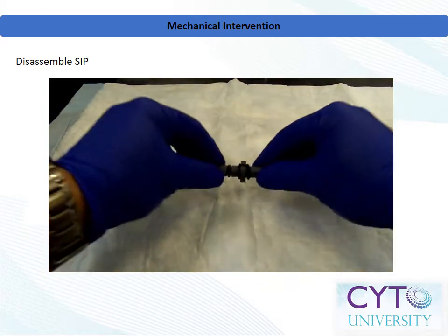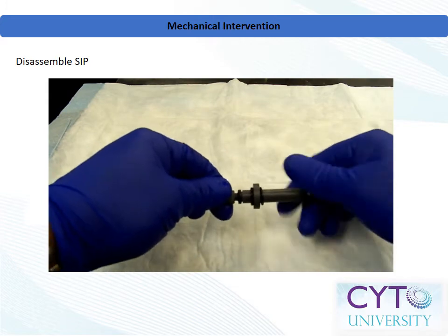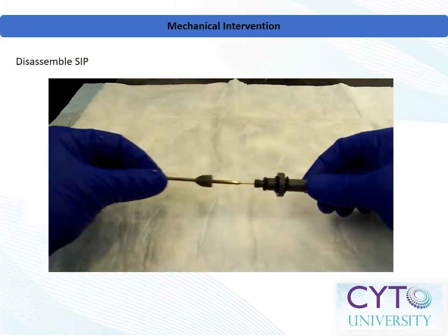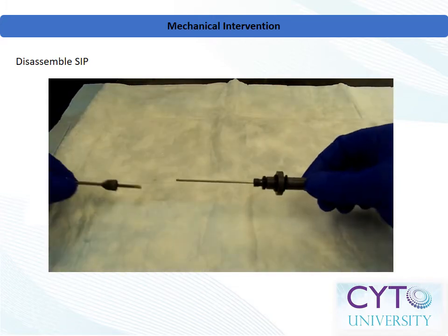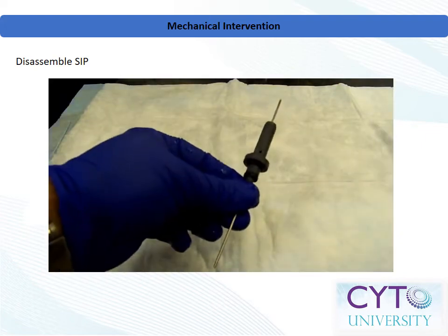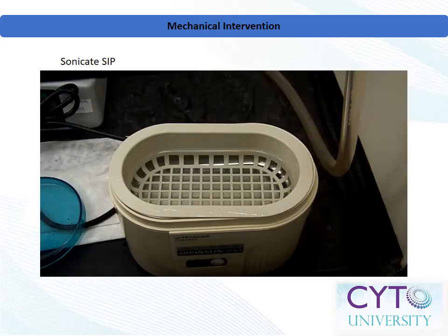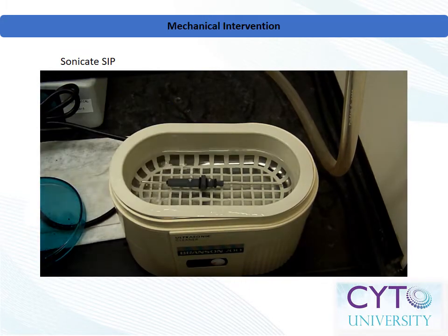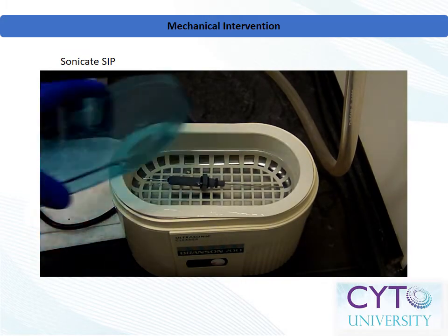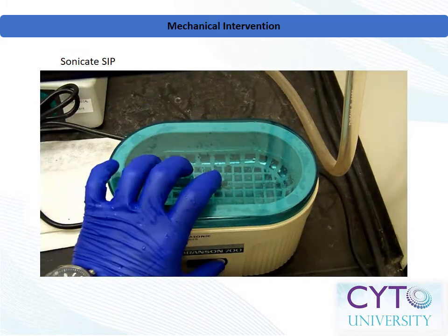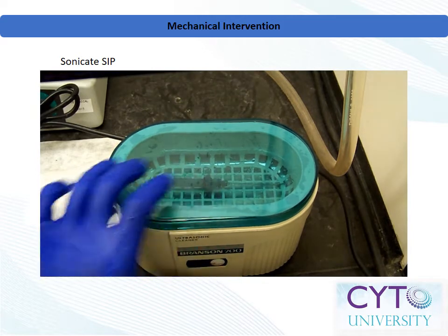With the sample injection apparatus out of the instrument, take special care not to drop or impact the apparatus onto any surface. Remove the outer sample injection port tube by unscrewing the cone, then gently slide the outer tube off of the inner tube. We will present three options to remove a clog from the sample injection tube, in order from most gentle to least gentle.